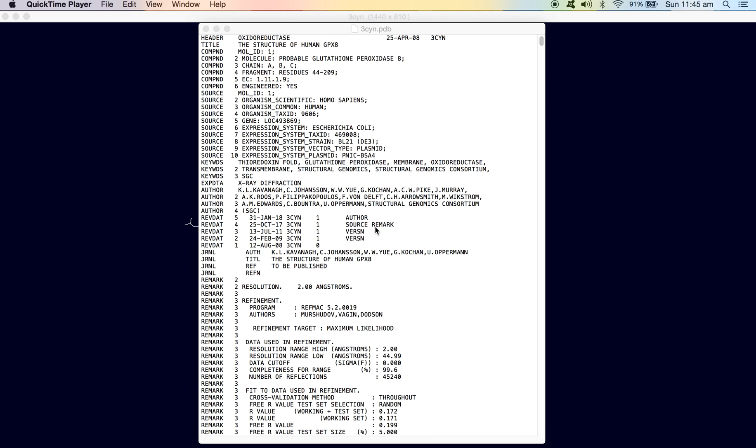Today we will look at a simple method by which we can induce a change in a specific amino acid of a protein structure. And for that, I have chosen a PDB structure with its code being 3CYN. And this is a glutathione peroxidase from homo sapiens or human beings. So, we will use this molecule for our demonstration and we will see how we can induce a specific change at a specific position in this structure.